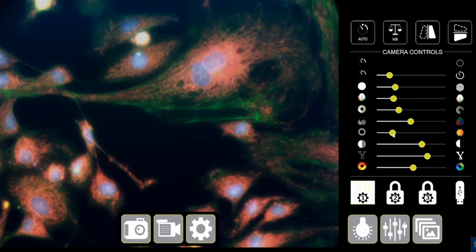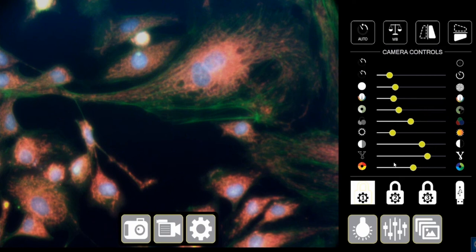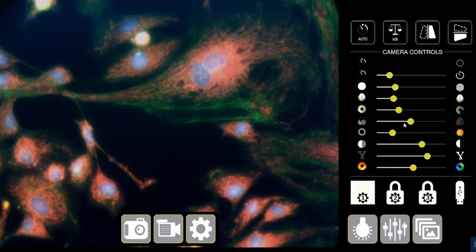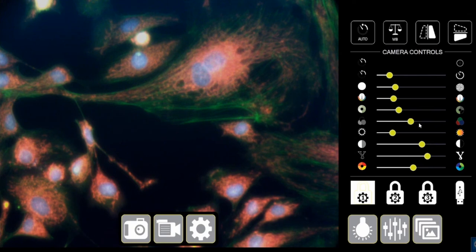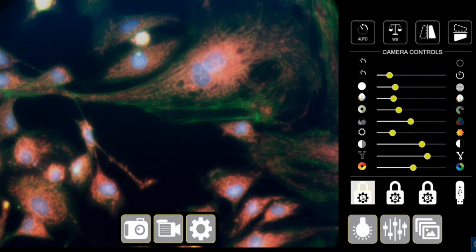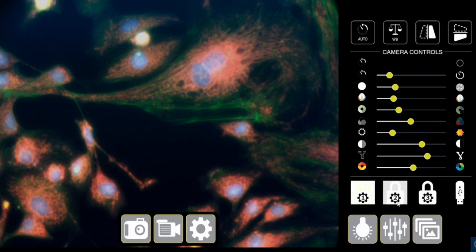So this is now set optimally for my sample and I have locked in at the number one position and I can choose my settings accordingly. I can increase or decrease the color, the gain. I have preset it at one and I can choose to save it by hitting the save button. You can so on and so forth. You can save settings in two and three.